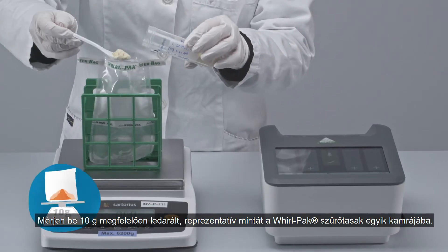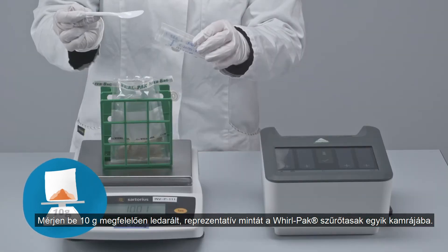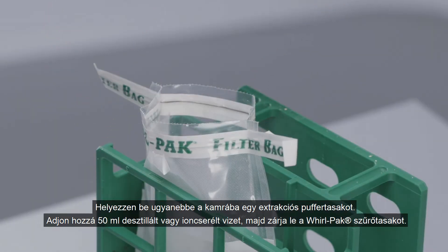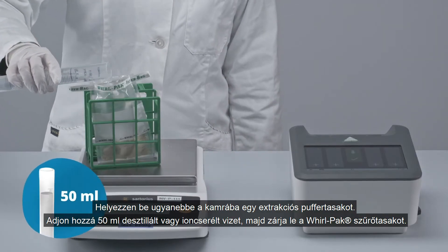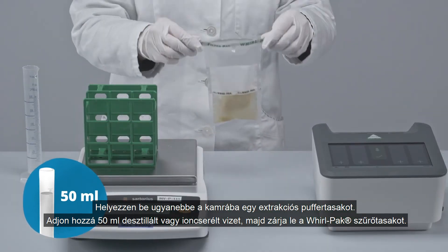Weigh in 10 grams of an adequately ground representative sample into one side of a Whirl-Pak filter bag. Add one extraction buffer bag into the same side. Add 50 milliliters of distilled, deionized, or bottled water and close the Whirl-Pak filter bag.